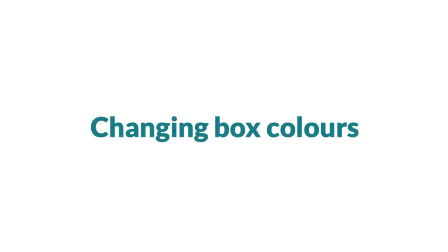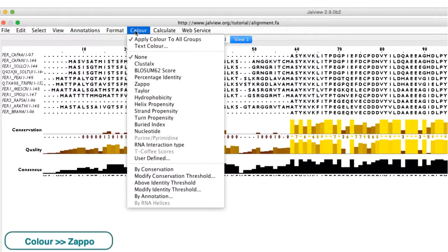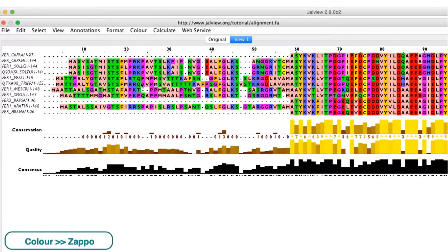The colors of the residue boxes can be changed via the color menu as demonstrated in our previous video.